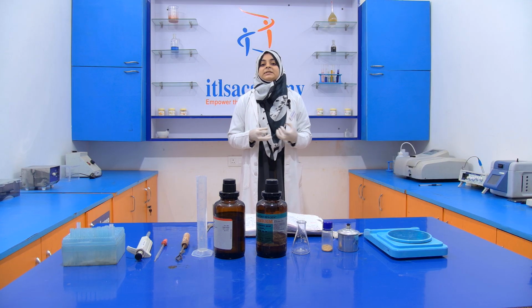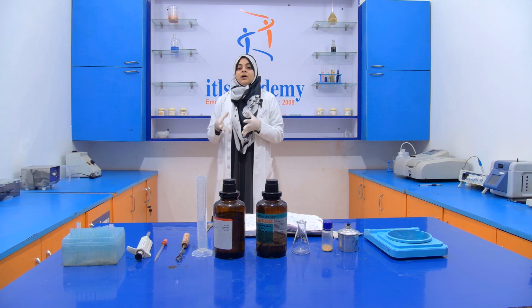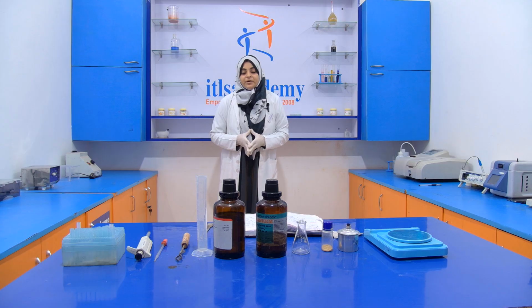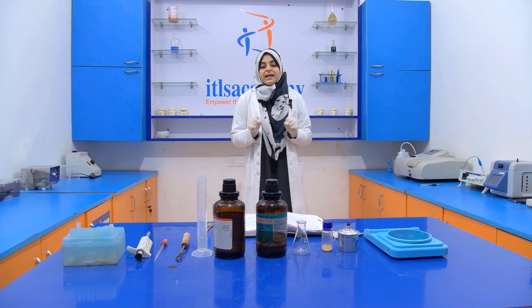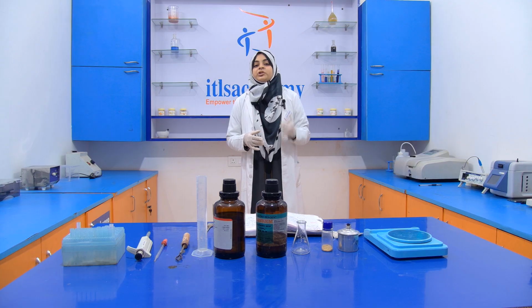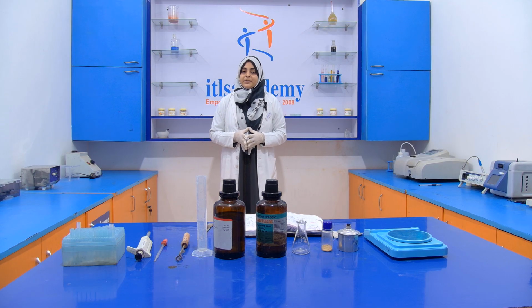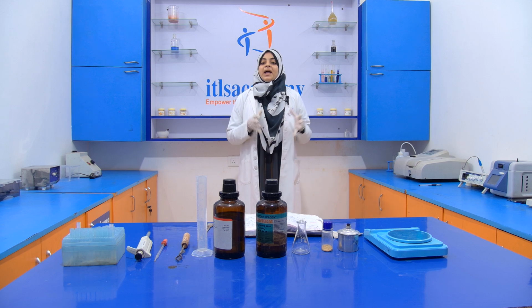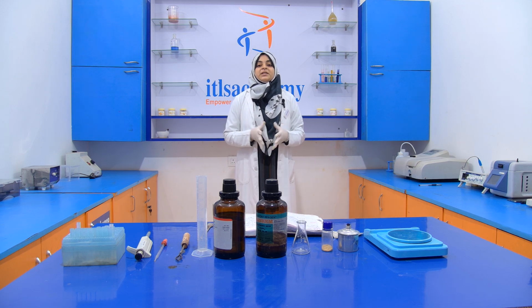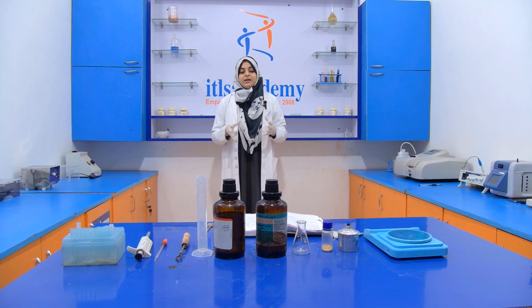to increase the quantity, because when we add this colophony residue into the asafoetida, it looks similar to the asafoetida and mixes with it, and by seeing it we can't differentiate it. That's why this colophony residue is added into the asafoetida, and the substances which are used in the process of adulteration are known as adulterants.